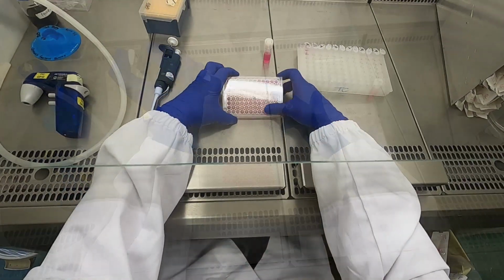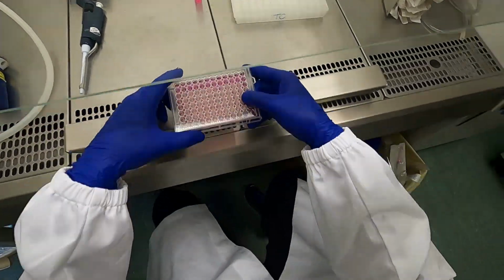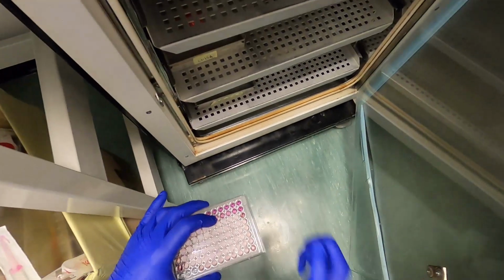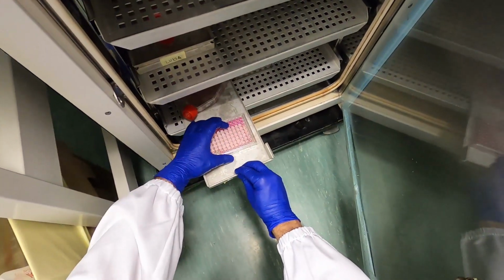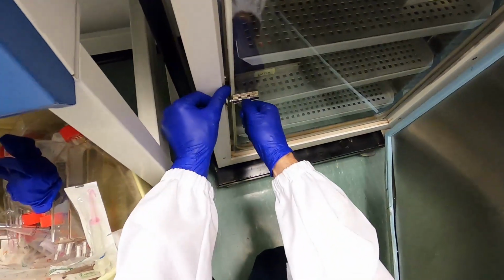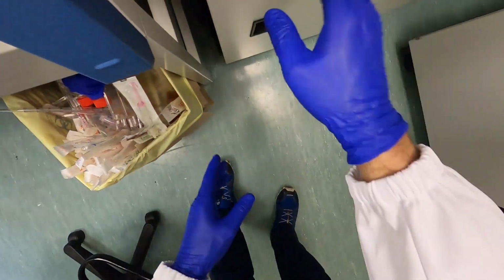That looks really beautiful. You've also done the second row, row B, with the control medium, just medium with fetal calf serum without addition of anything. And now the cells are ready to incubate overnight. That was it for today.